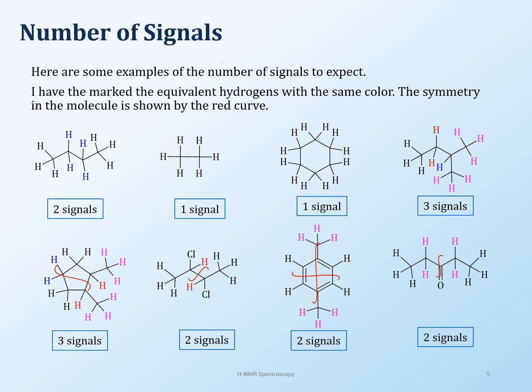I mean, you can run it, but there's no point, because the whole point of NMR is for you to be able to see different hydrogens on it. So here is another one. Now here you have different kinds of protons, so you can see the different colors I've given to you.